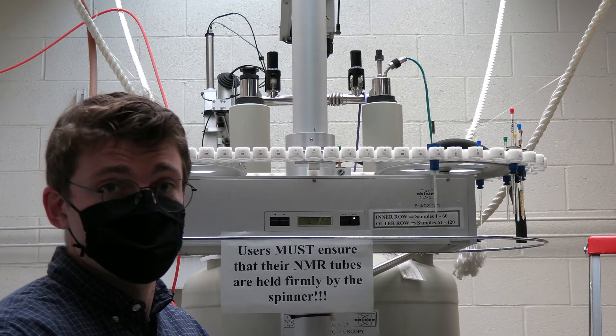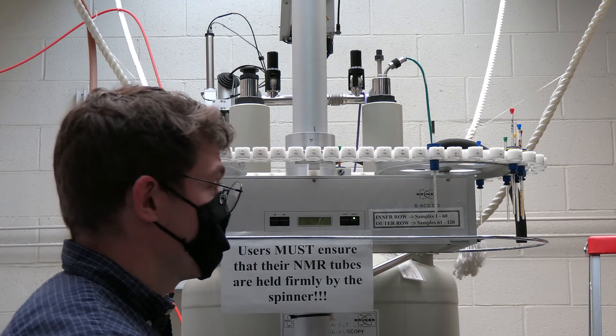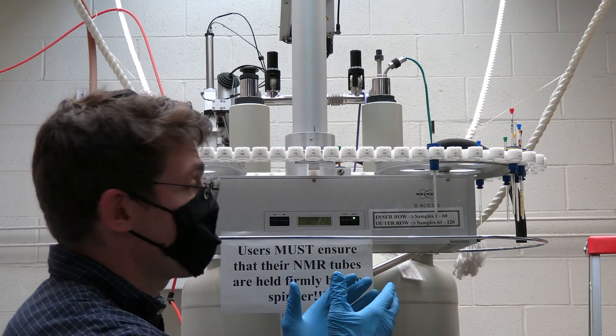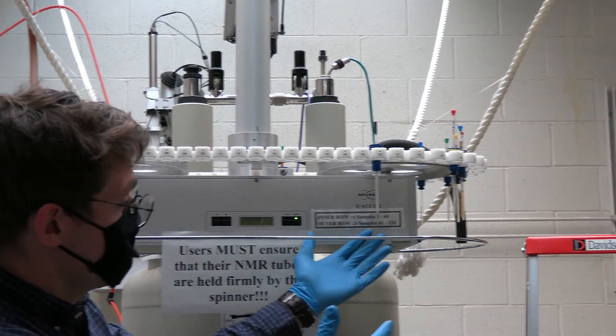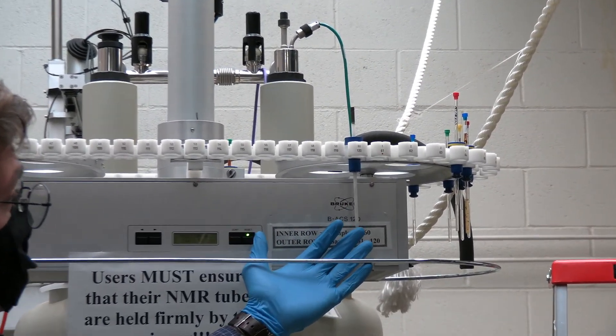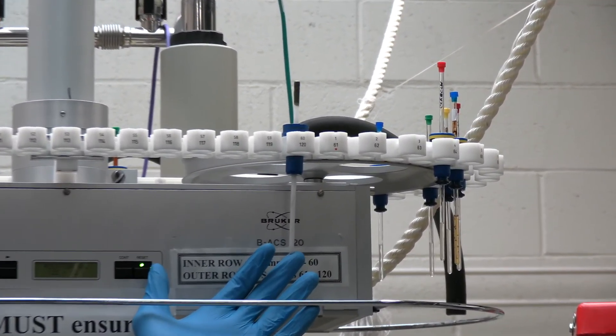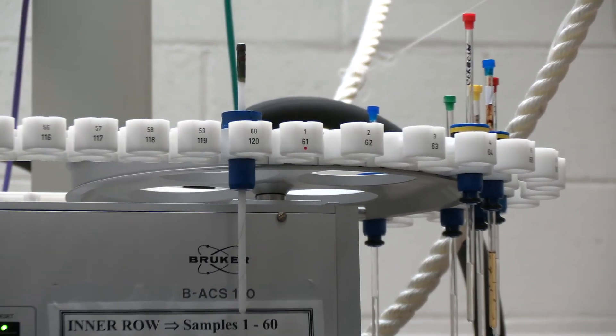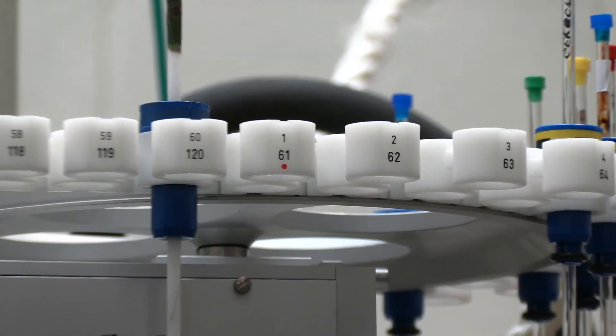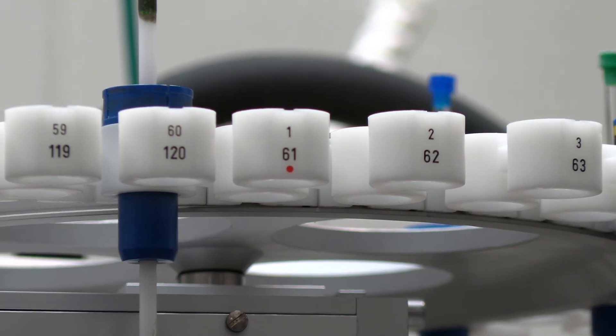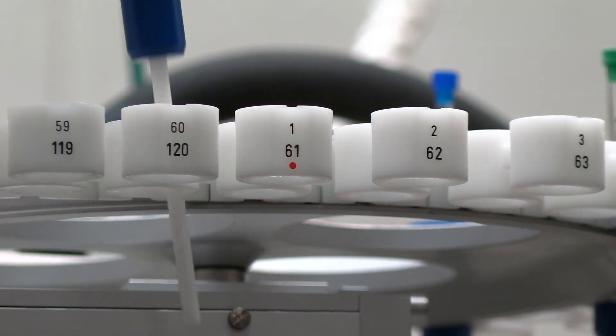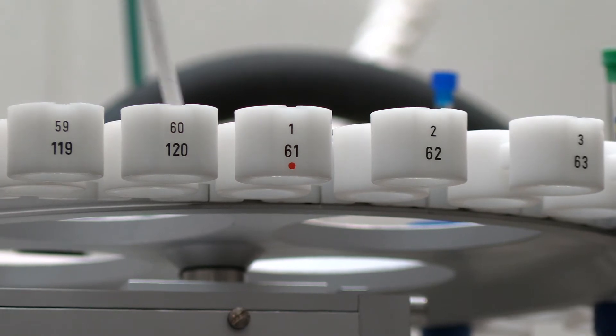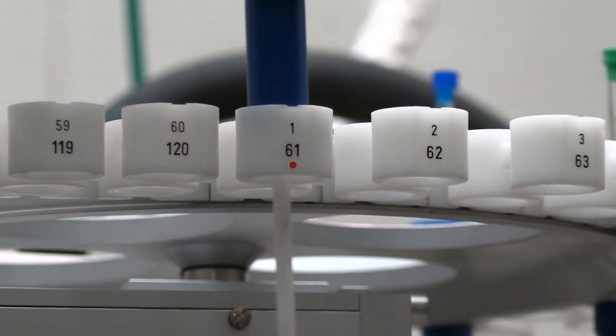One issue that commonly trips users up is the transition from position 60 to 61. Let's say in this hypothetical scenario you walk up to the carousel and the dummy sample is in position 60. As you remove it and place it in the next position which would be in spot 61, that position is now in the outer row. We have marked this position with a red dot as a visual indicator to help remind you to make this transition to the outer row.